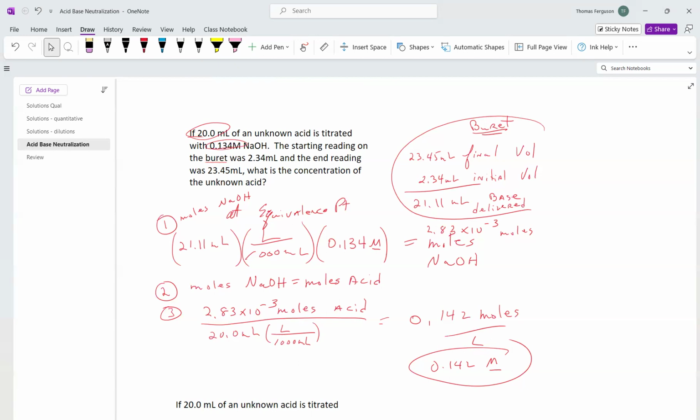You're going to crush them up and do a titration. Same thing. You're going to have 2 runs, average them together for each one. Normally we do 3, but because we're doing 2 labs today rather than 1, we're going to do just 2 good runs. Again, are there any questions? By the way, there's going to be one of these on test 5. There's always a titration question on the last test. So let's do another one.